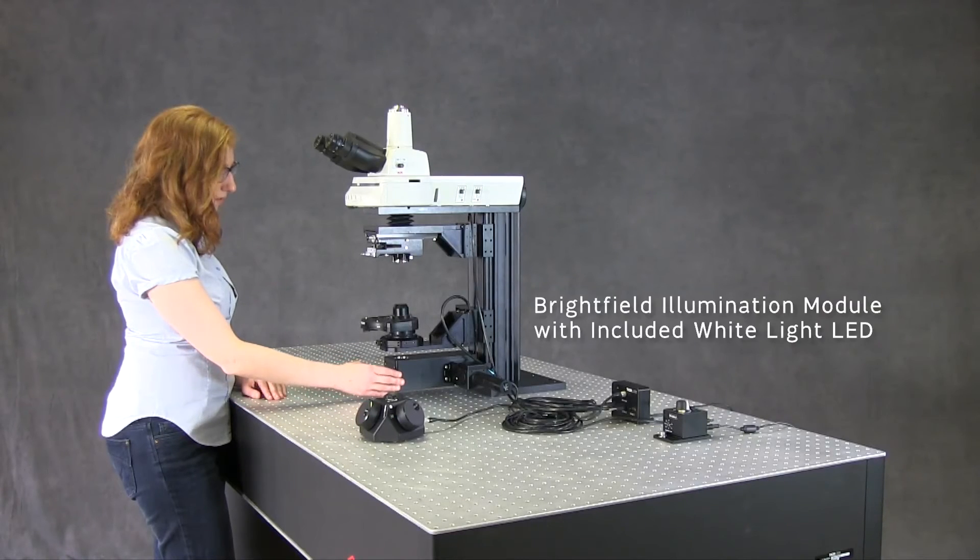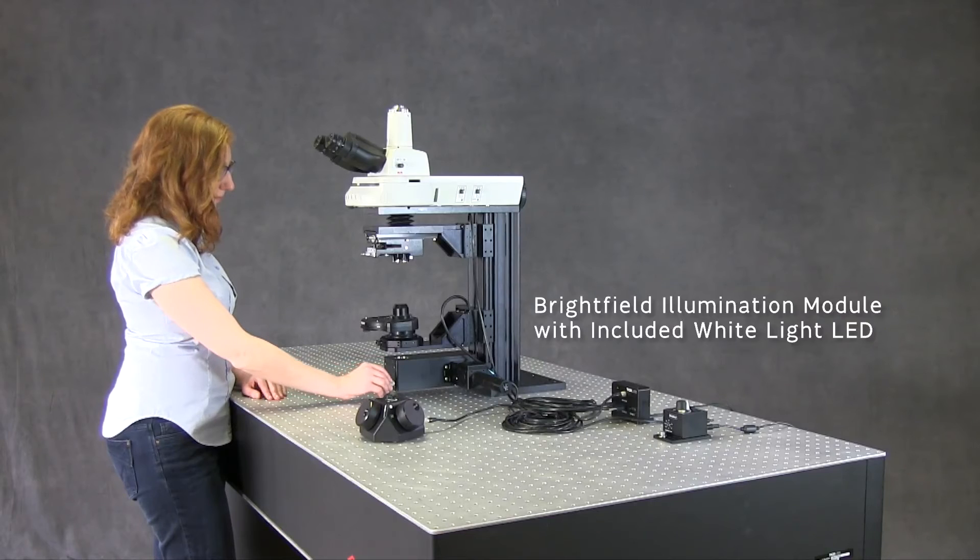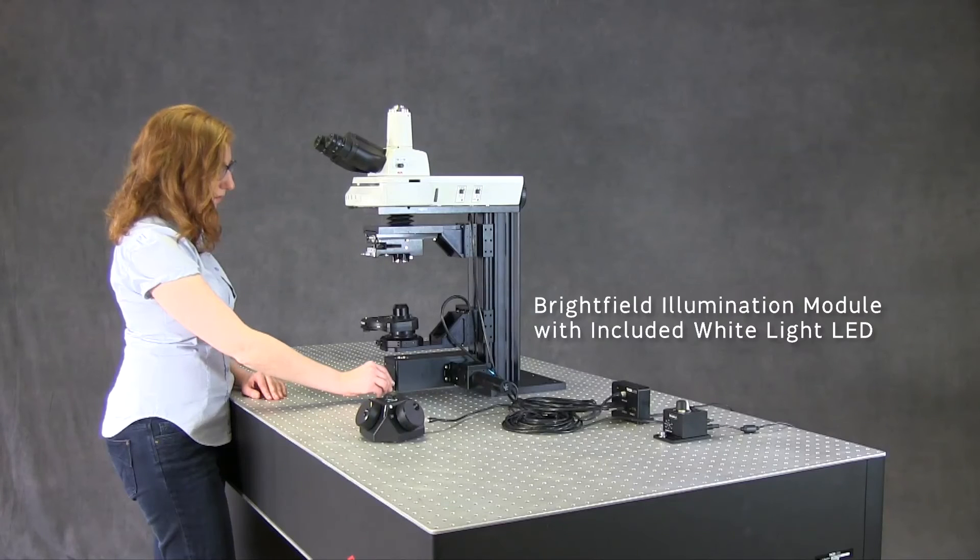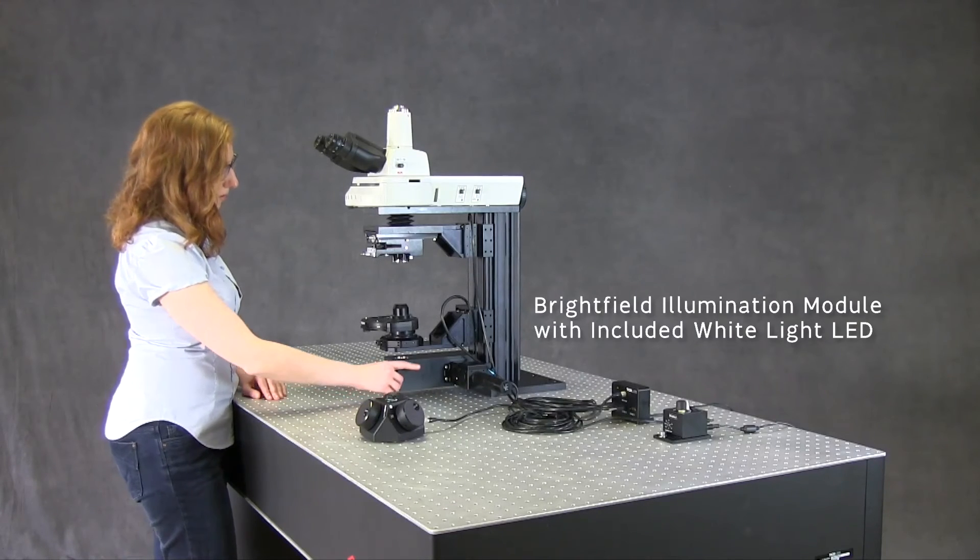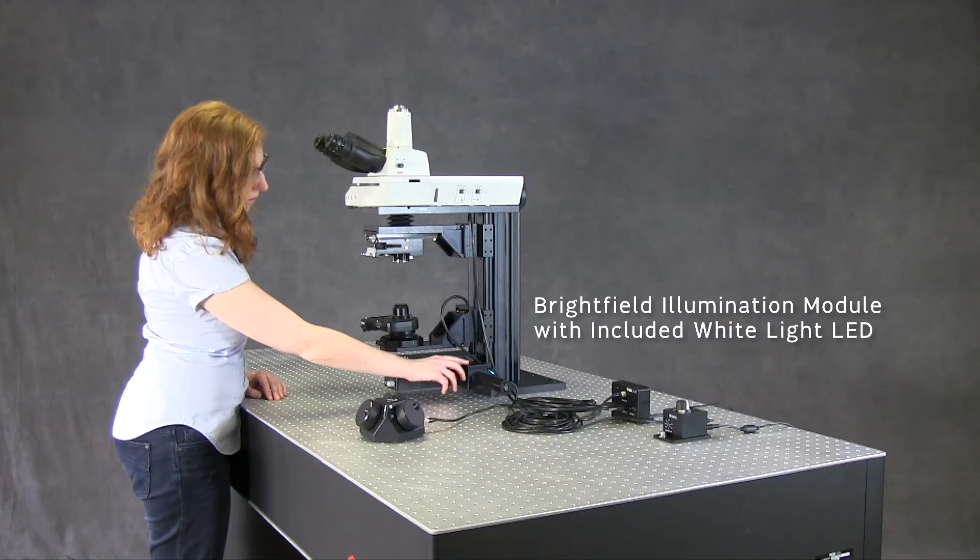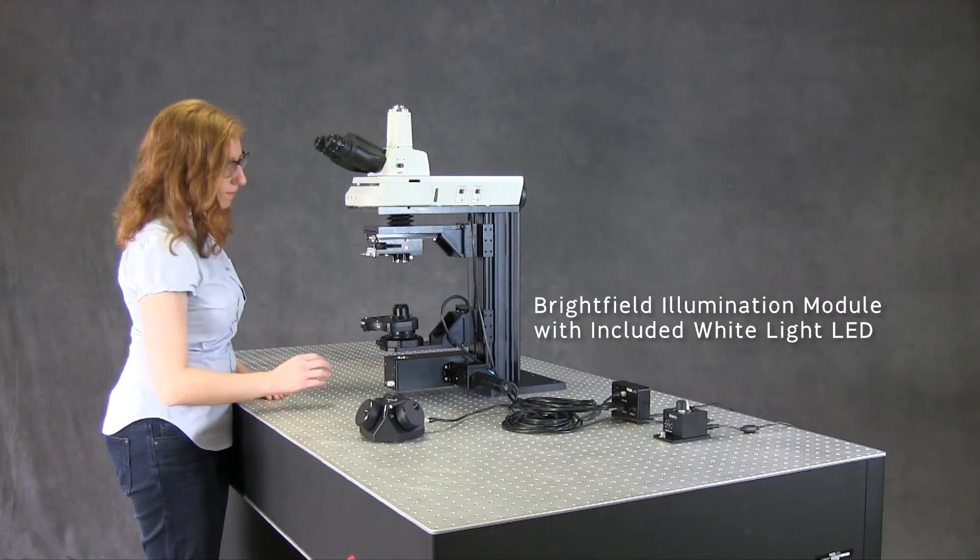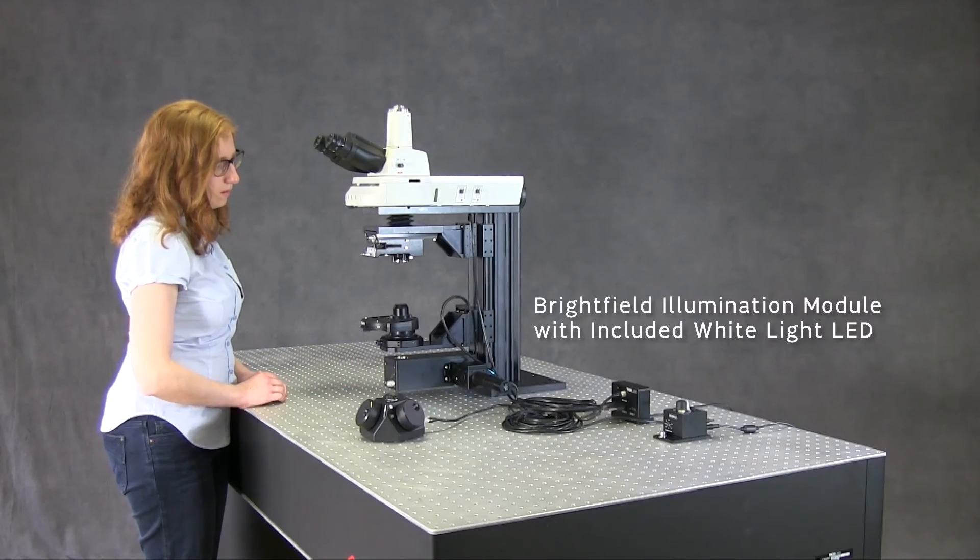To support brightfield imaging, we have added a transillumination module with a white light LED. A built-in iris is opened and closed by rotating the knob on the front. The LED is attached to the module using a filter cube, which offers an extra port if you wish to add another illumination source later.